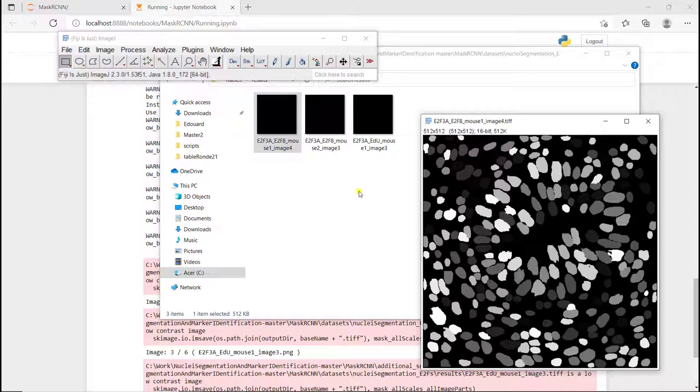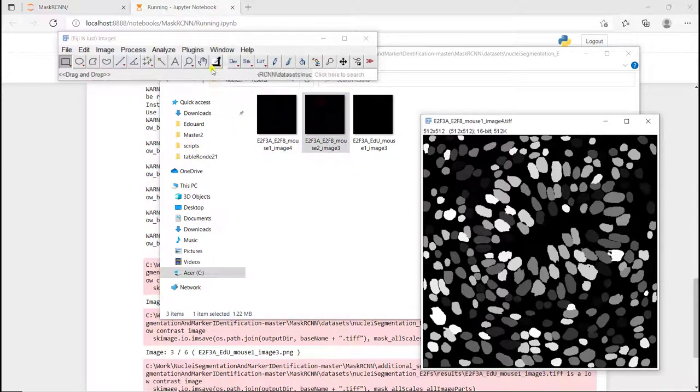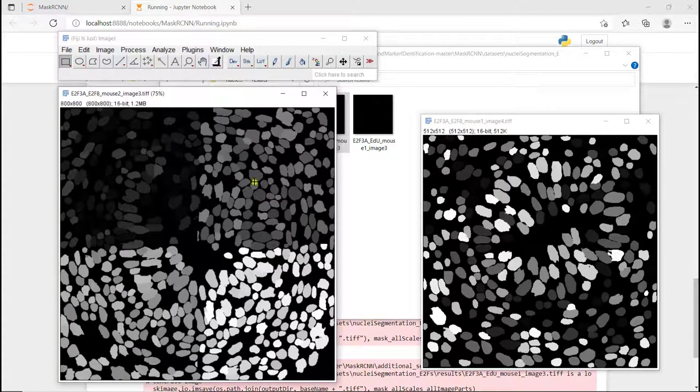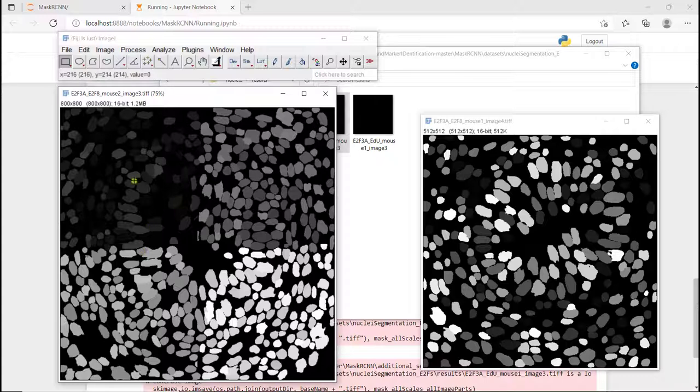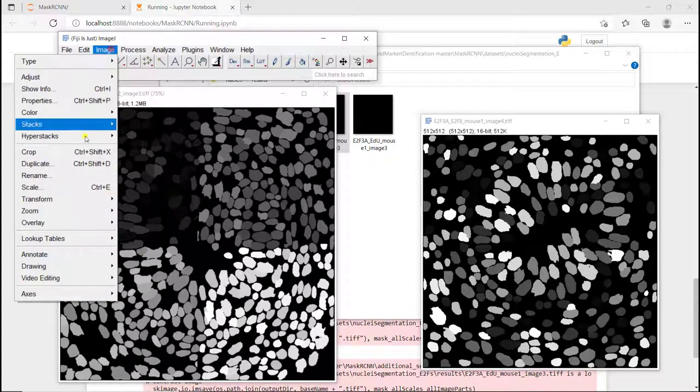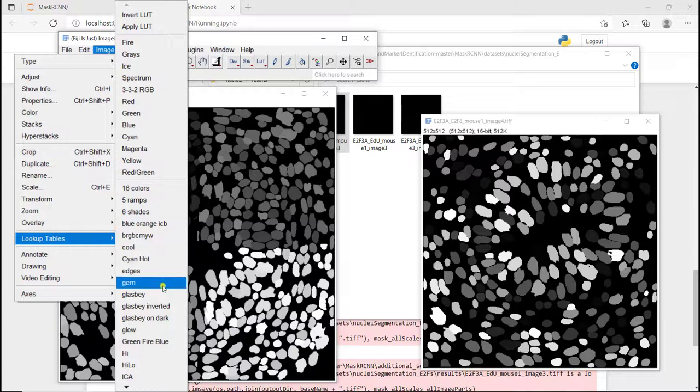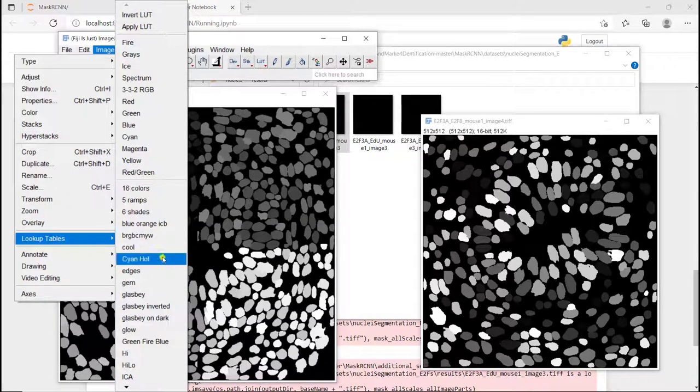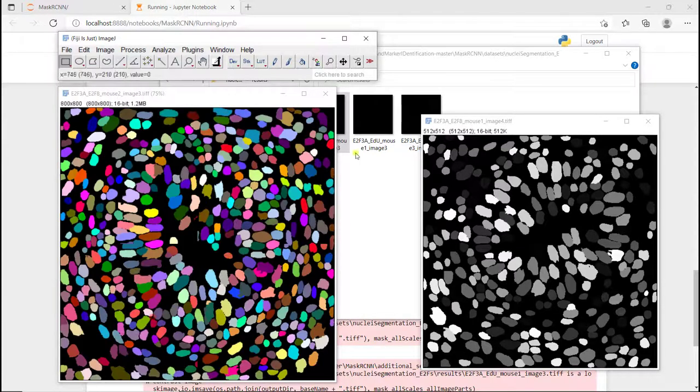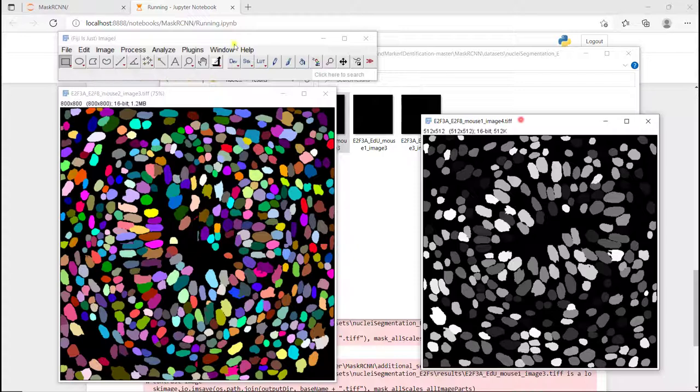As you can see, it's not perfect, definitely not perfect. But we just used two augmentations, so by increasing the number of augmentations, we would definitely improve the results.